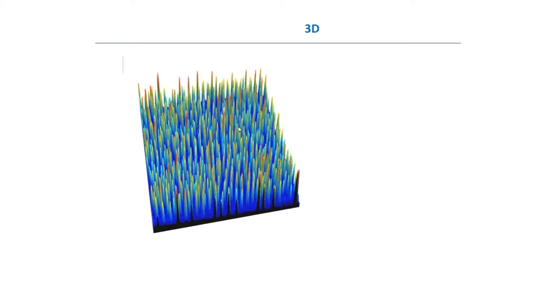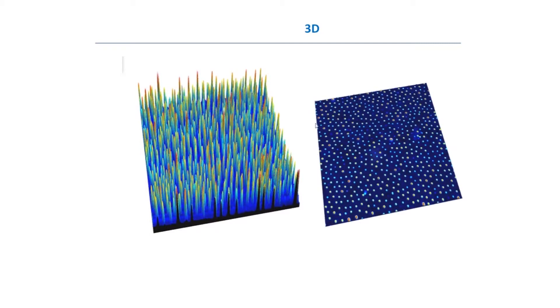Since we have a matrix of X and Y values, we can represent this as a 3D image. Unfortunately, in many papers I've seen, people try to stretch the 3D image in the Z-direction. Instead of seeing a nice distribution of nanoparticles — quantum dots in this case — over the surface, you get a spiky image that doesn't give any useful information. Please don't do this.